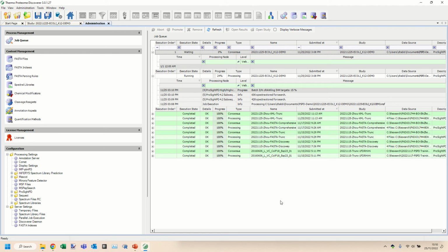This morning when I was running a search on here, it said at first that there were 56 batches, so it said batch 1 of 56 and 2 of 56, and naturally when it got to 55 of 56 and 56 of 56, I was very excited thinking it's almost done, but it kept going until batch 64, so don't let it lie to you. The software may or may not finish when it has done 4 batches in this case.